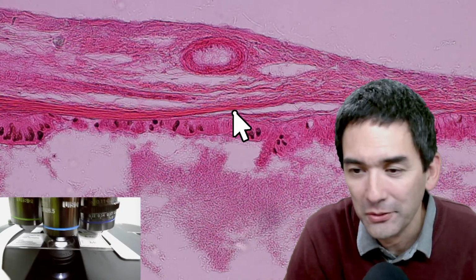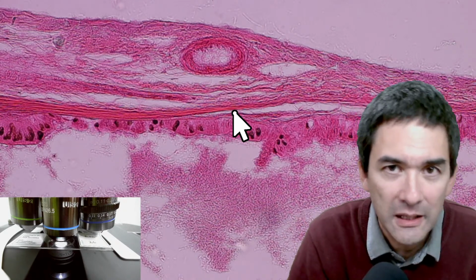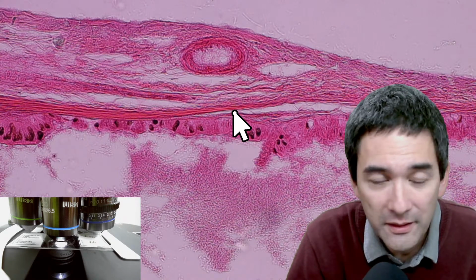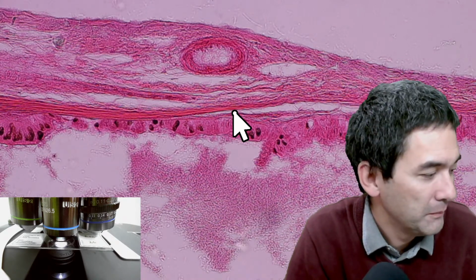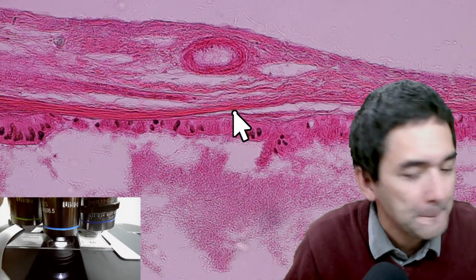Yeah, I have to. Yes, I agree. Yeah, botanical section, you take a stem and you take a microtome, and you make thin cuts, and you'll be fine. And animal tissue is indeed more complicated. Yeah? So let's move on a little bit.